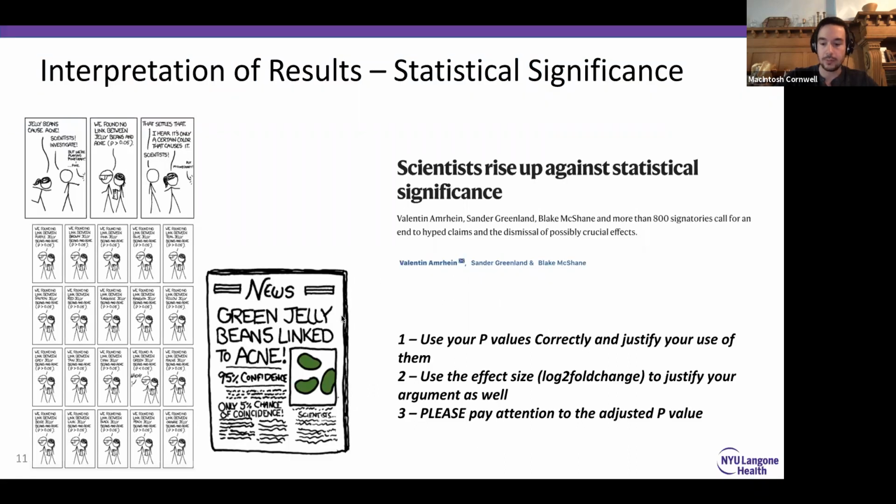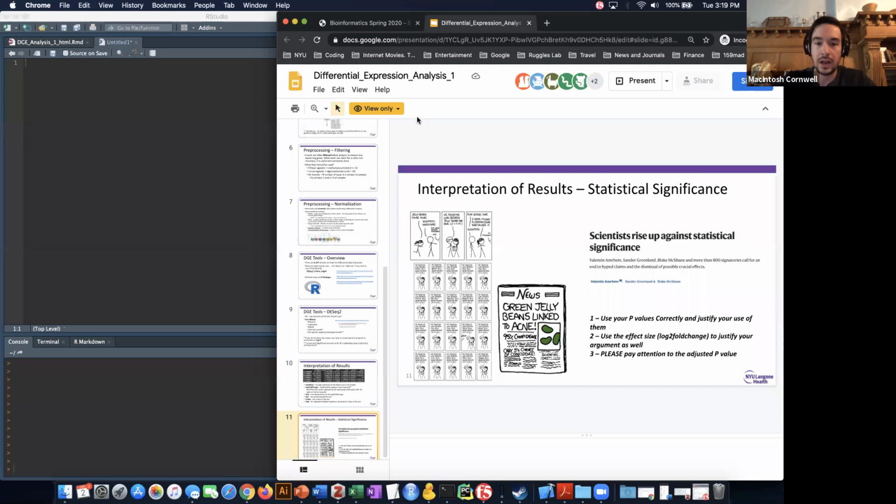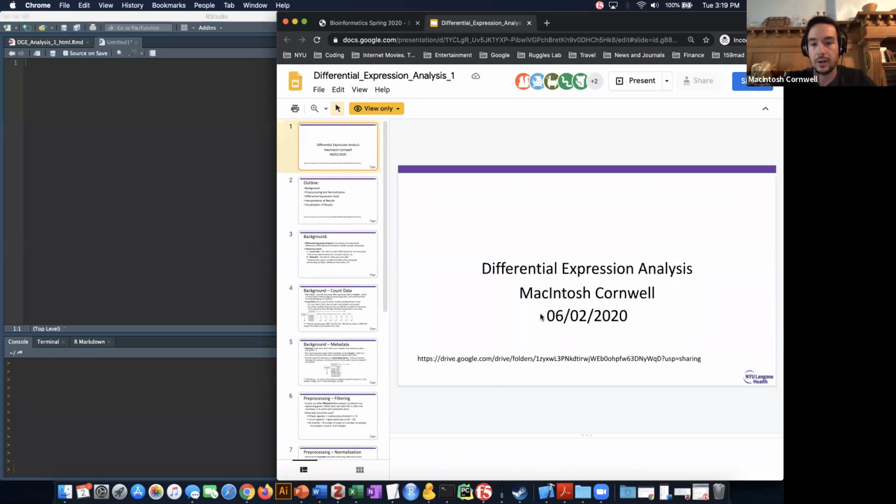So that's pretty much it as far as things that I wanted to go through for my slides. I think the most useful thing I can do at this time, though, is show a live demo of what this actually looks like in practice. So I'm going to close out of these slides, and you can follow along at home.